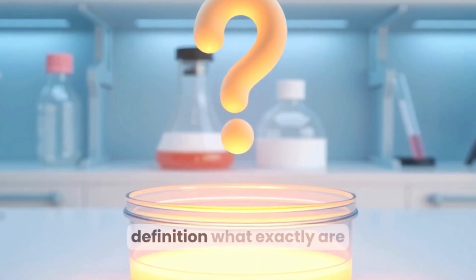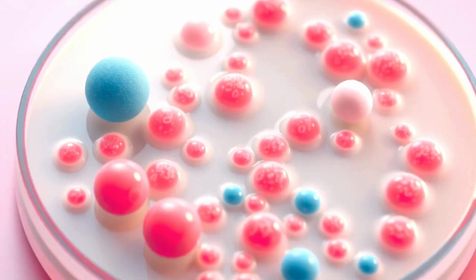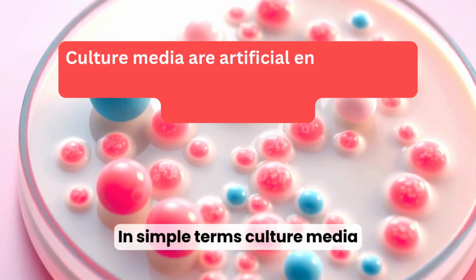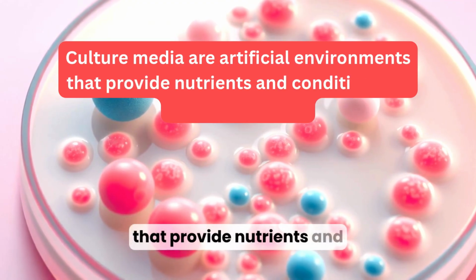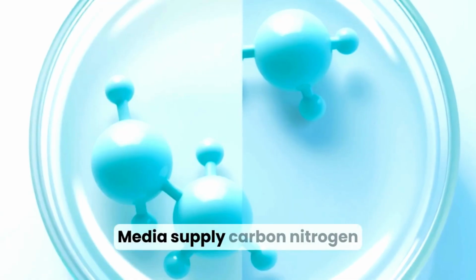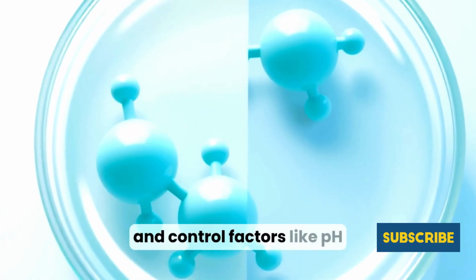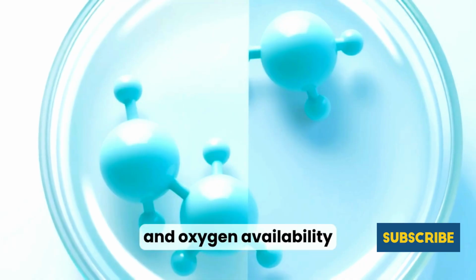Let's begin with a clear definition. What exactly are bacterial culture media? In simple terms, culture media are artificial environments that provide nutrients and conditions for bacteria to grow. Media supply carbon, nitrogen, minerals, vitamins, and water and control factors like pH and oxygen availability.